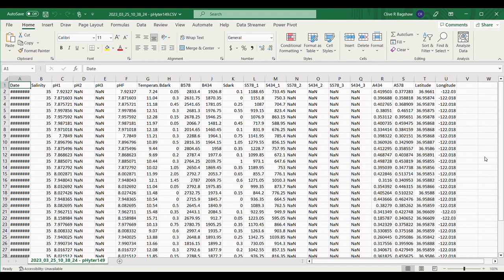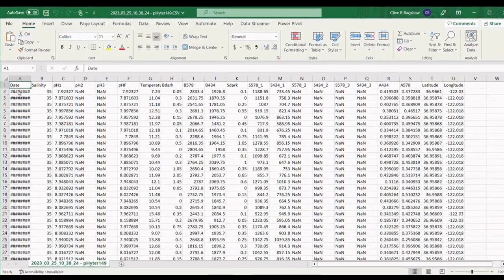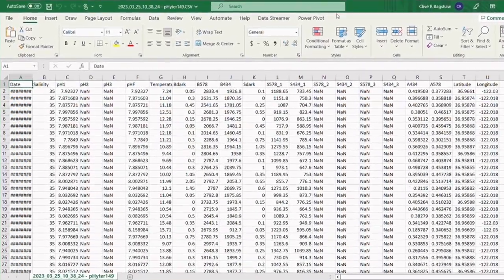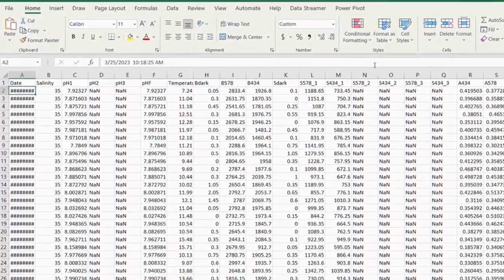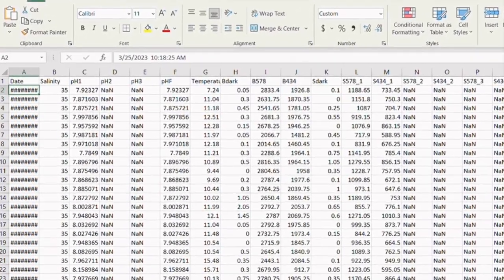The file from your smartphone transferred to a computer will be saved as a comma-separated value file, .csv file, which we can open in Excel. The date column is too narrow, so we need to auto-format column widths.